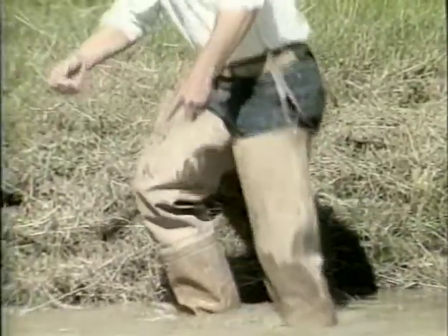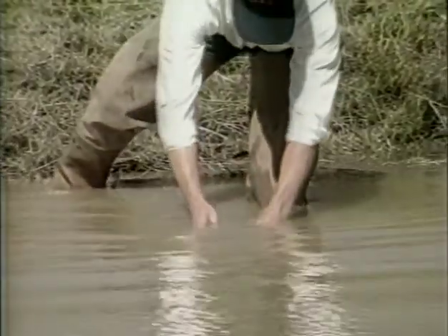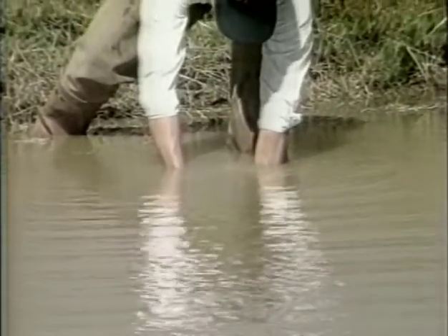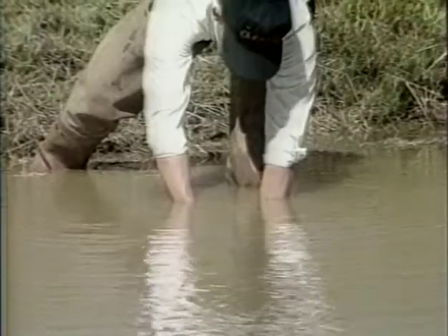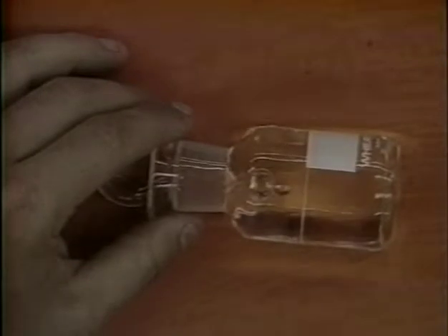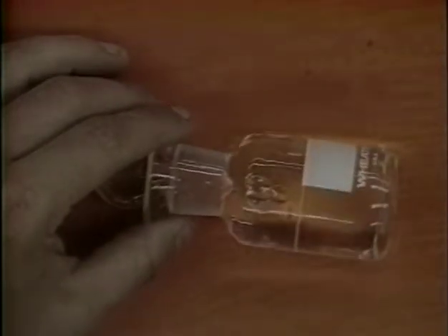This will usually give you the lowest reading in the pond. To take the sample, submerge the bottle approximately 1 foot below the surface. Unstopper to collect the sample, and then restopper the bottle under the water to ensure that no air bubbles are trapped. It is important that no air bubbles are present, since they will increase the dissolved oxygen value by dispersing the oxygen from the trapped bubbles into the water sample.